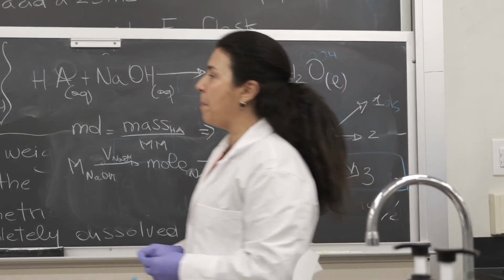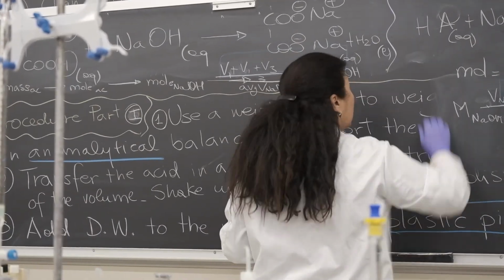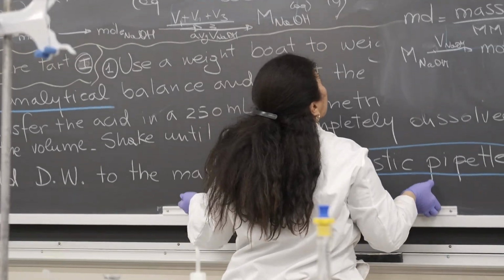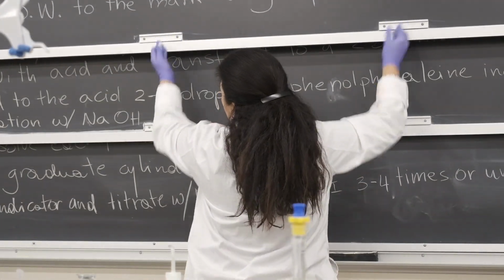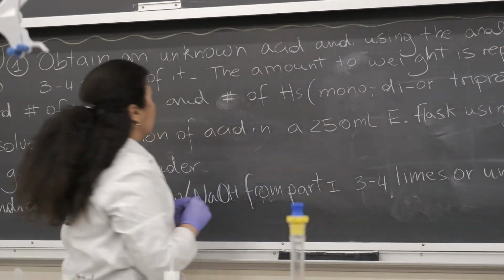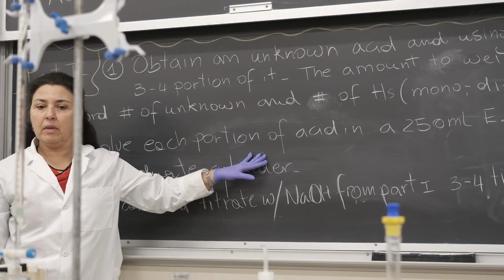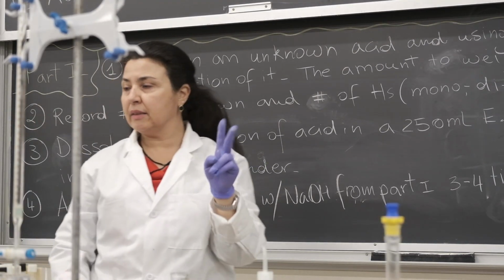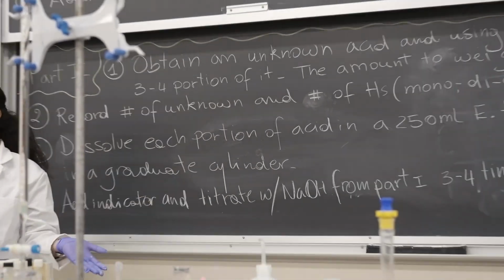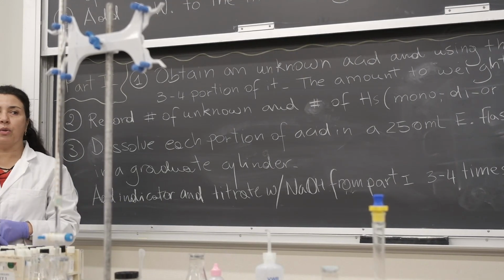Also, in the second part of the procedure, you're going to gain extra points if you get a very faint pink. Okay? So, twice the possibility to collect extra credit, in part 1 and part 2. This is it. Let's get started to work.